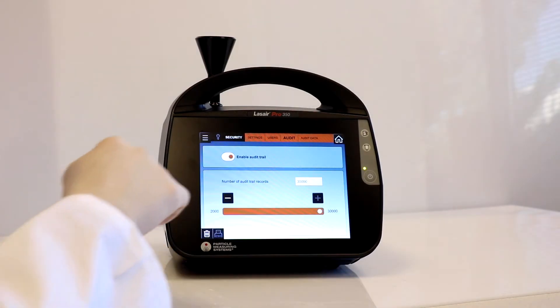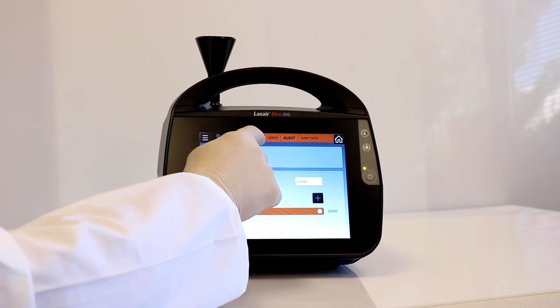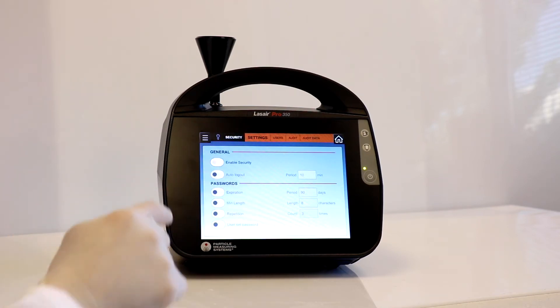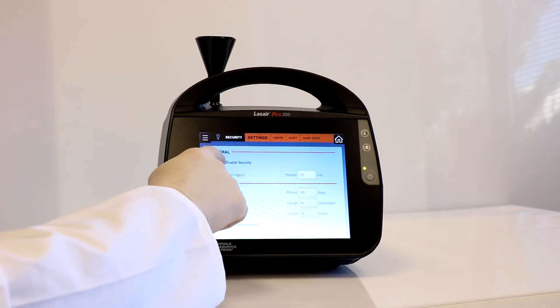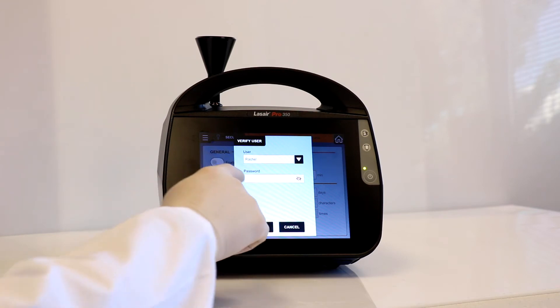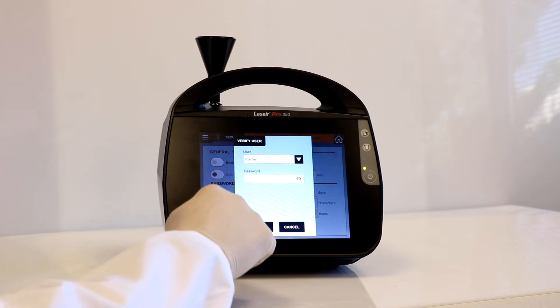Next, we select the settings table and enable the security function. Here, we enter our administrative password and select OK.